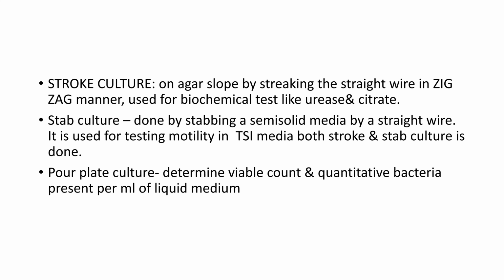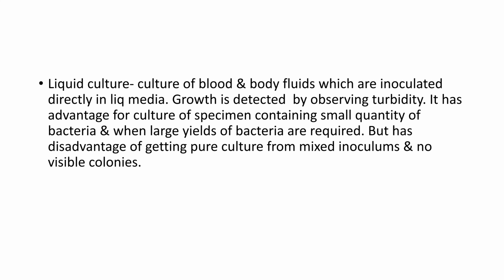Last but not the least, the pour plate culture. It is used to determine the viable count and quantitative bacteria present per ml of liquid media, that is in the urine culture. Those culture methods were for the solid media or the semi-solid media.